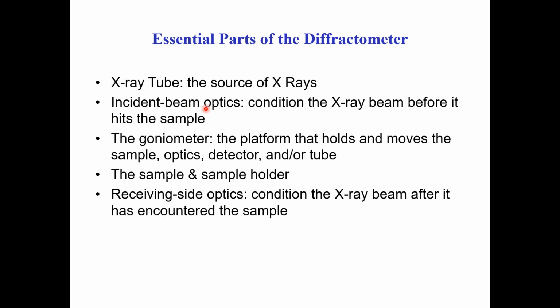The incident beam optics conditions the X-ray beam before it hits the sample, and the receiving side optics conditions the X-ray beam after it has encountered the sample.